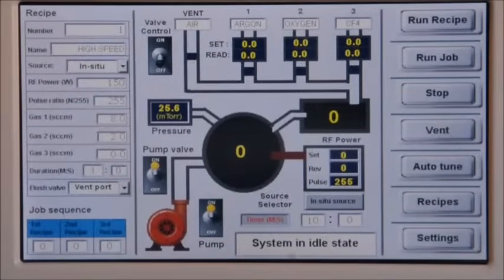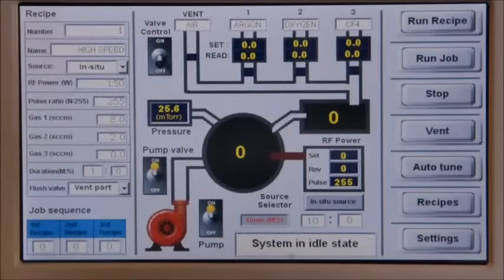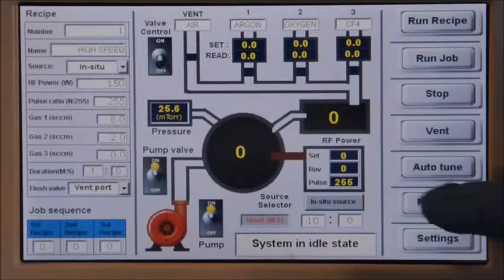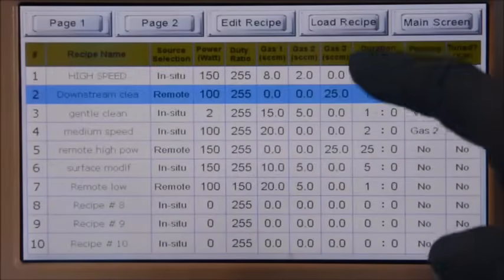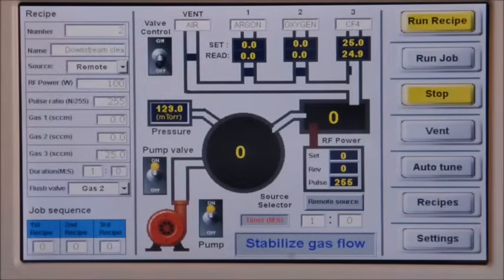Cleaning mode is a recipe setting — it can be specified as a recipe parameter. To perform a downstream mode plasma cleaning, simply load the downstream mode cleaning recipe from the library. The system will automatically switch to the remote plasma source. Once the gas flow and chamber pressure stabilizes, plasma will be ignited.